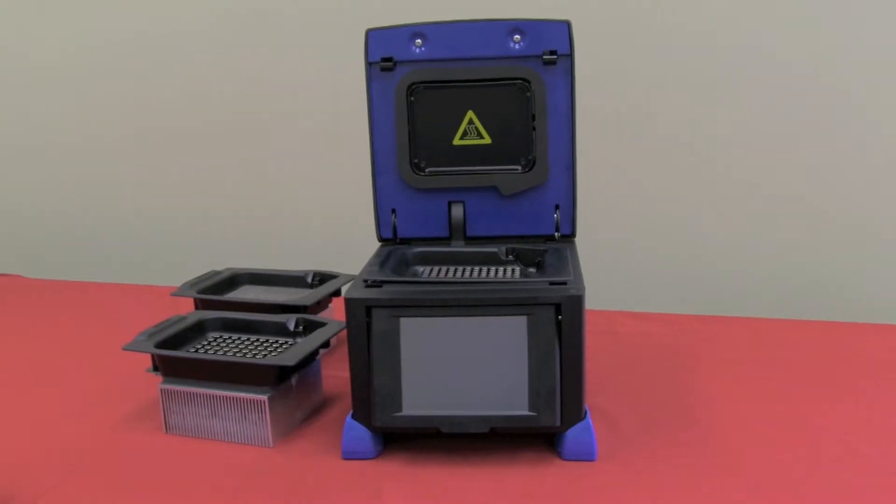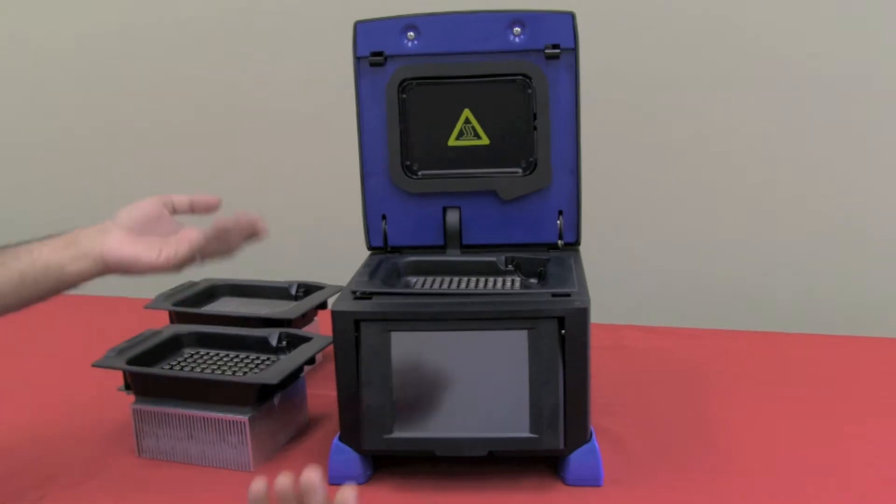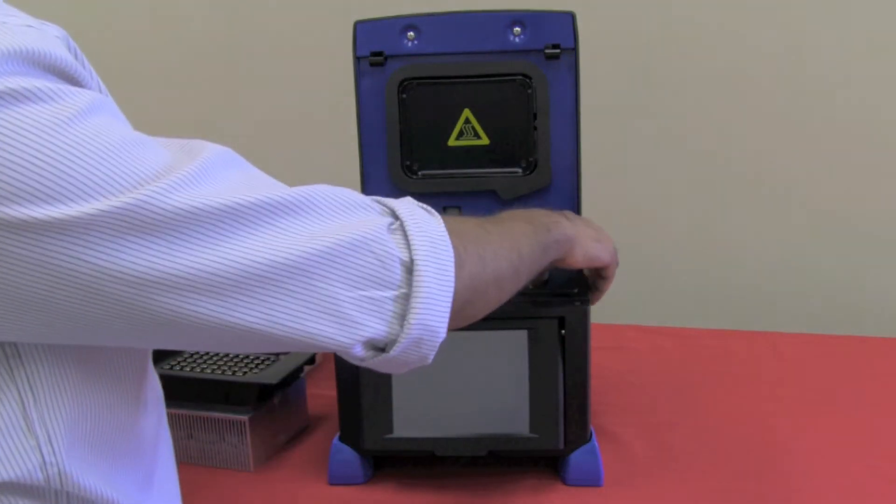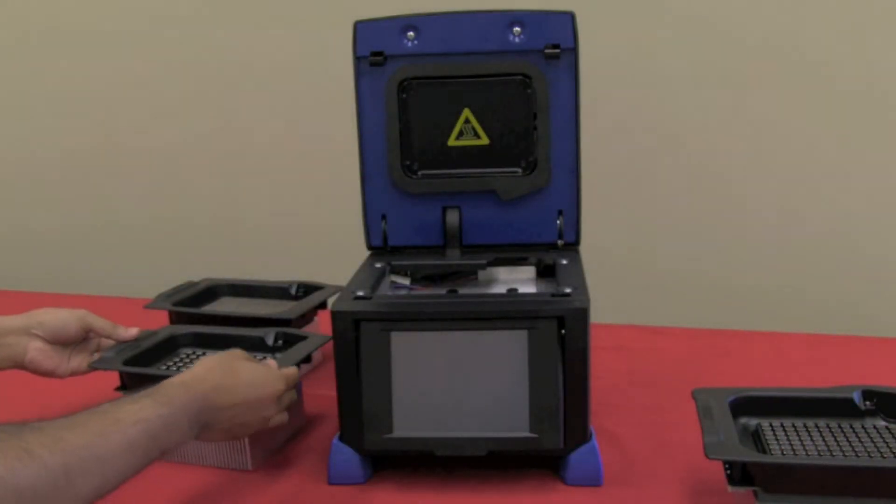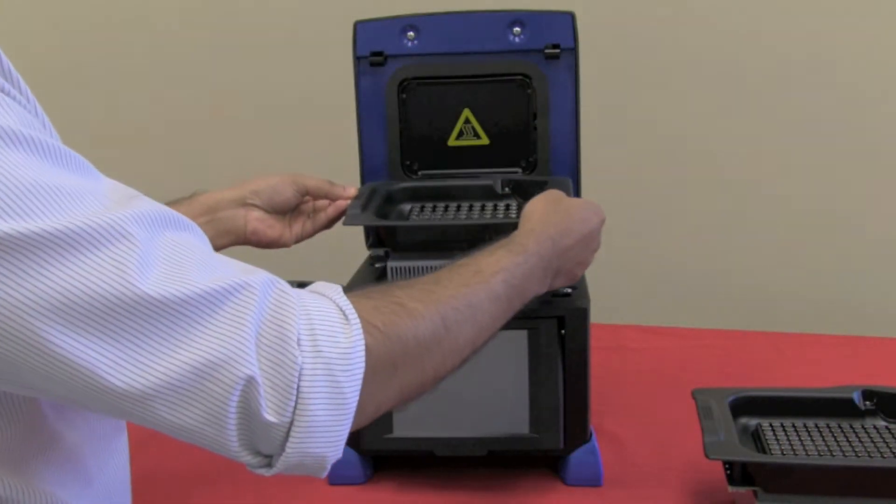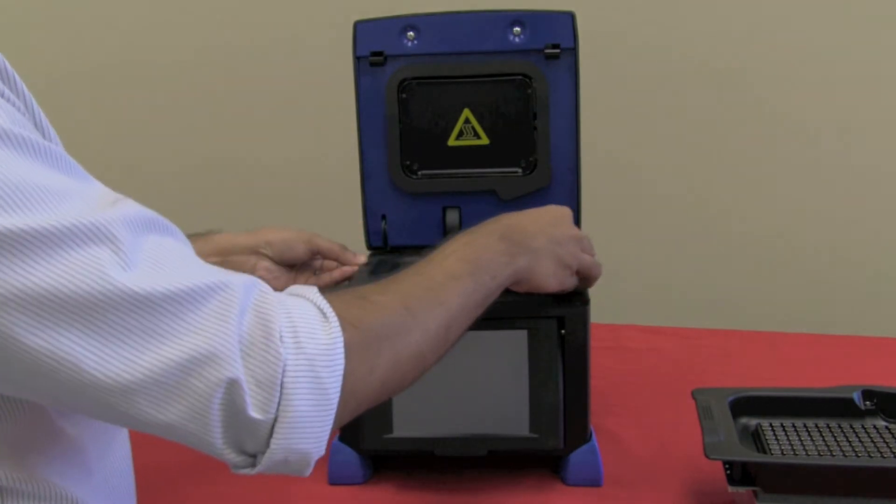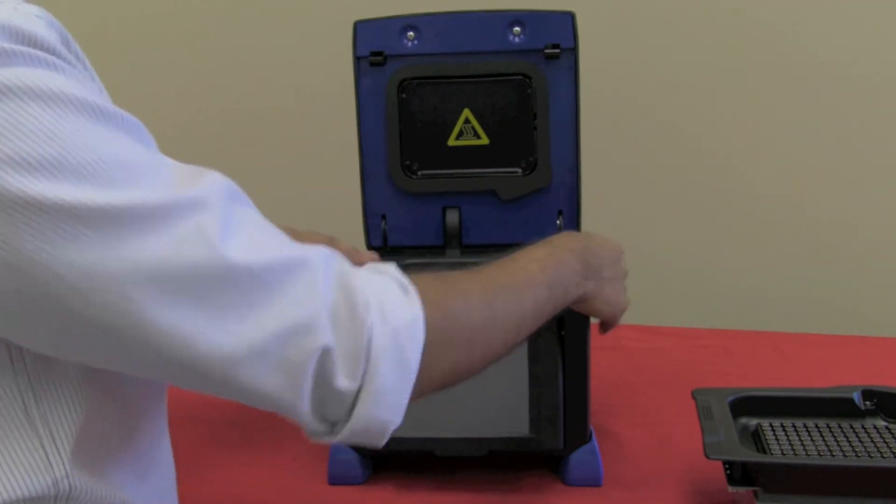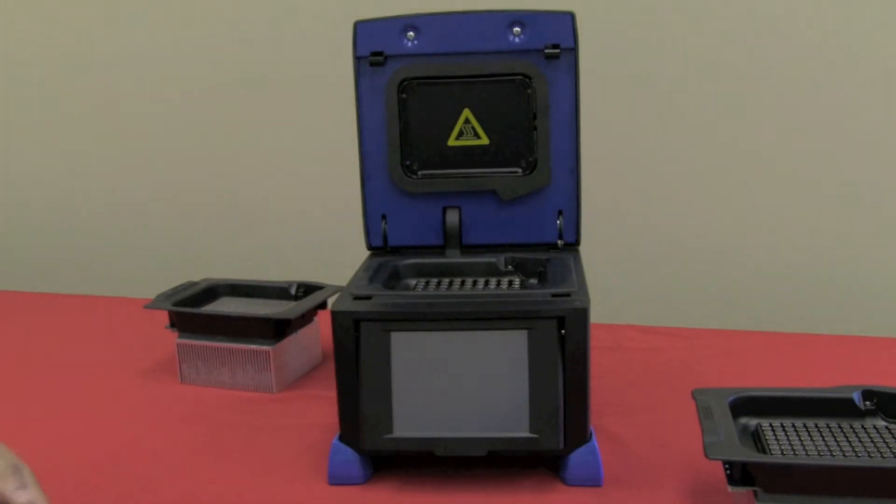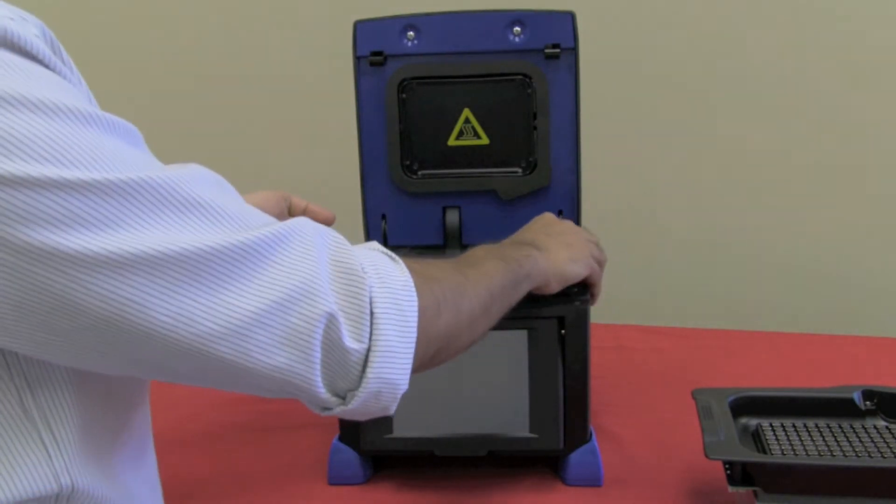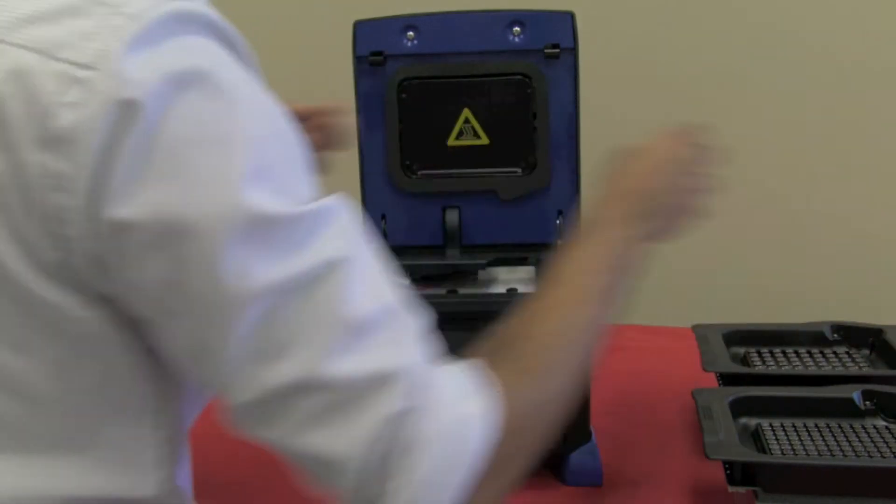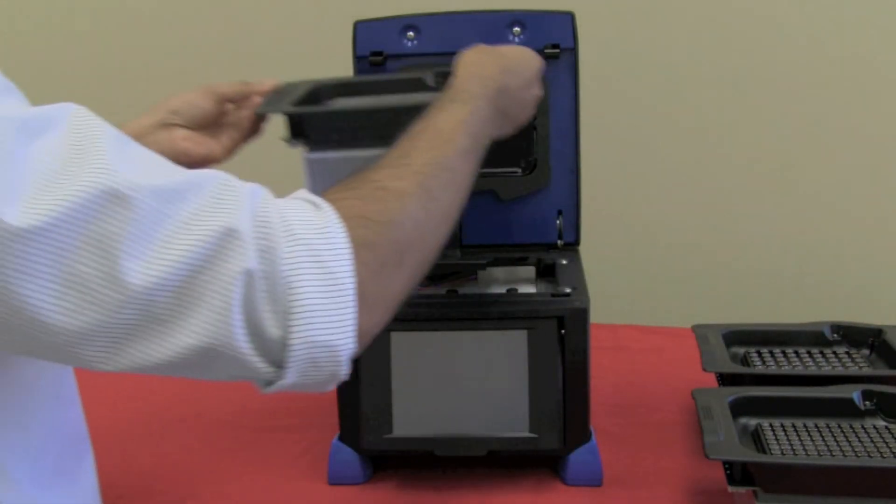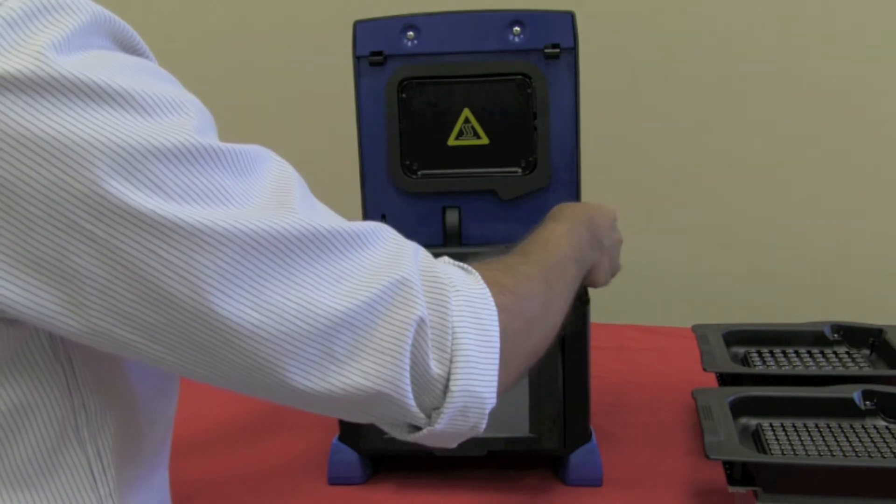I can also demonstrate just how easy it is to replace the blocks on the Amplitronics. It's as simple as this. Remove the block like so and replace the new block here. This is the 56-well block I'm inserting now and I've just removed the 96-well block. That's it, that's all that needs to be done. And again, we can remove the 56-well block there and replace it with the 384-well block there. It really is that simple.